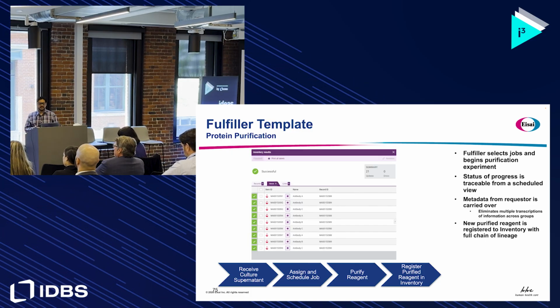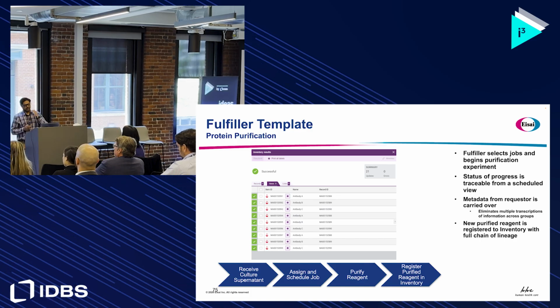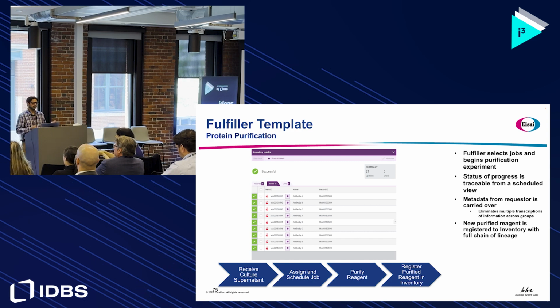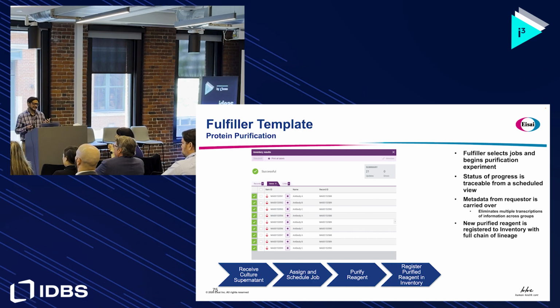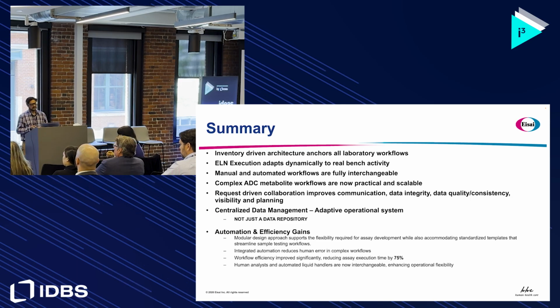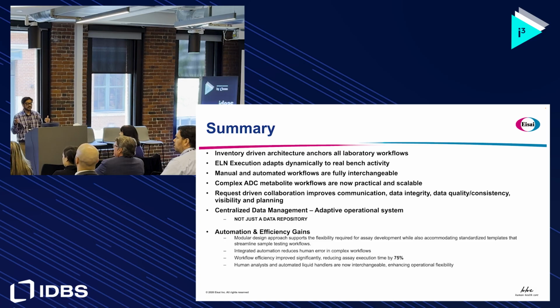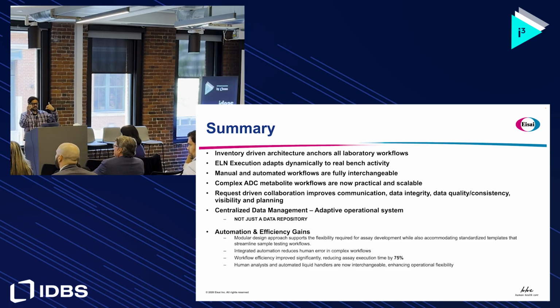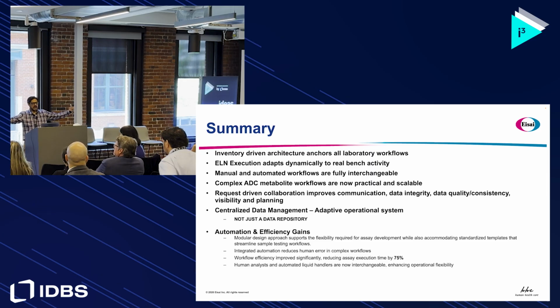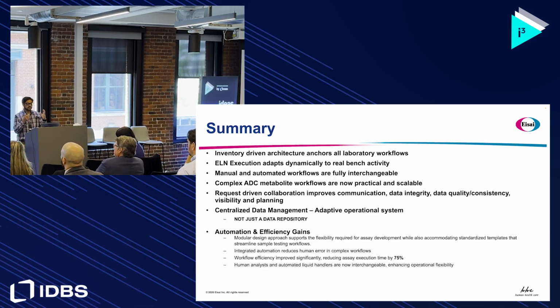Then whoever is doing the purification runs the purification, registers that all within the template, prints the labels, aliquots, hands it off to me, and I put it in a freezer, or whatever it is. That's the only communication outside of E-Workbook that's really necessary now. So that's where we are now, and we're expanding on this. We picked purification as the center point, and now we're building out request workflows from there on both ends. And so now that's our tie-in for this overall workflow.